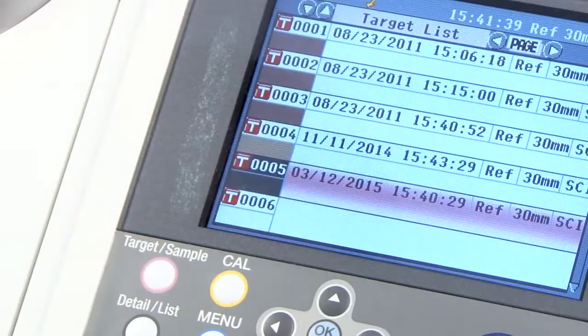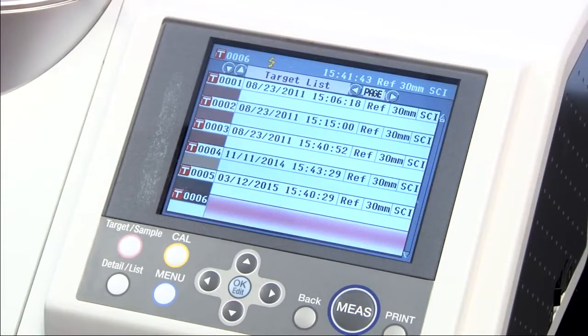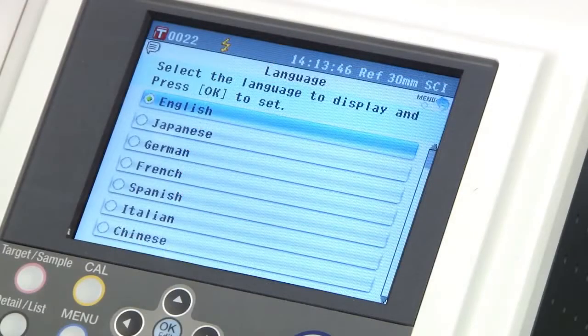In addition to the USB feature, the CM5 can store 4,000 measurements and 1,000 target colors in its large memory. You can even switch language settings.